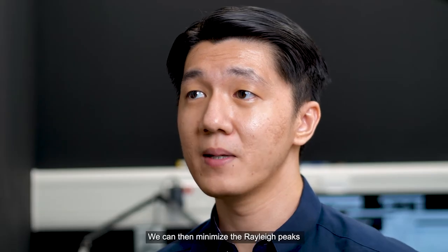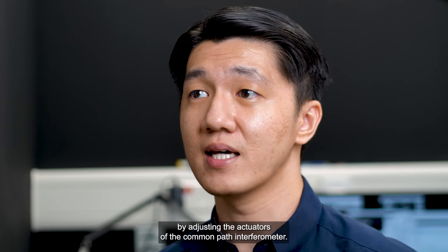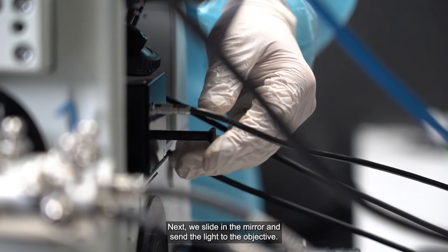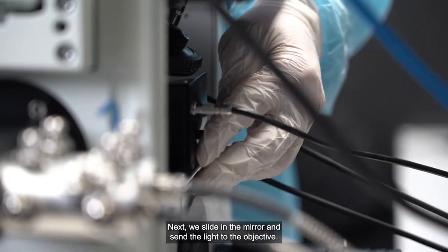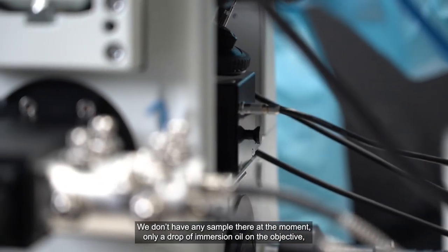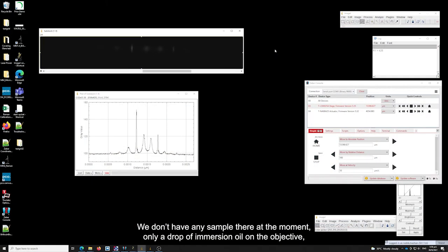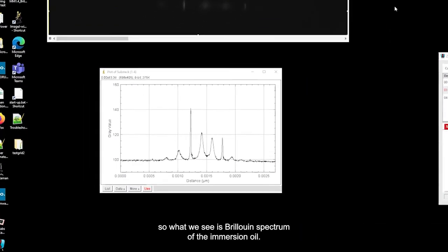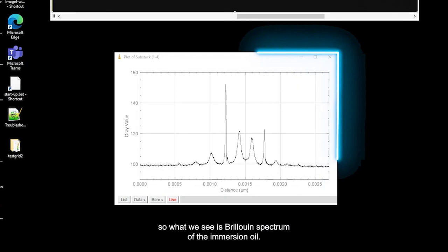We can then minimize the Rayleigh peaks by adjusting the actuators of the common path interferometer. Next, we slide in the mirror and send the light to the objective. We don't have any sample there at the moment, only a drop of immersion oil on the objective. So what we see is the Brillouin spectra of the immersion oil.